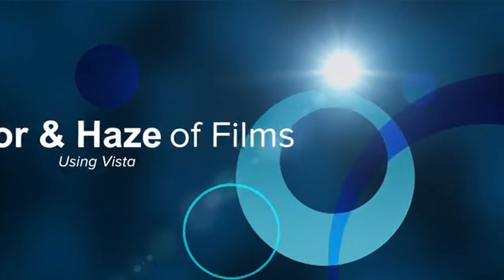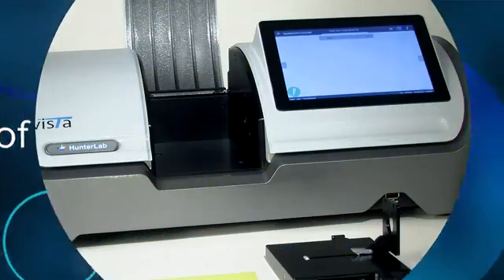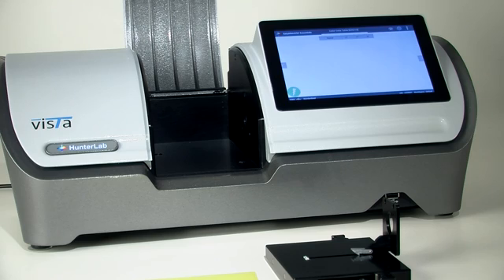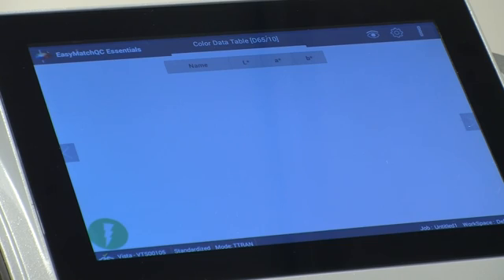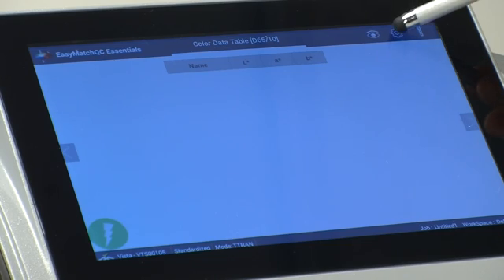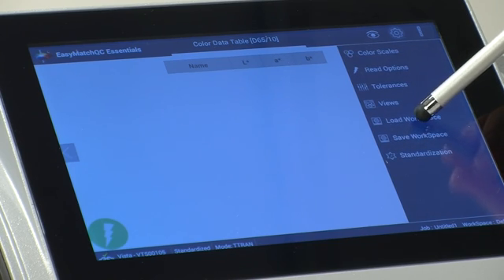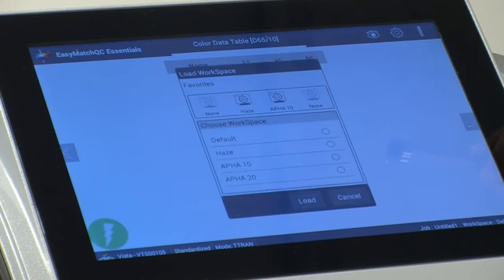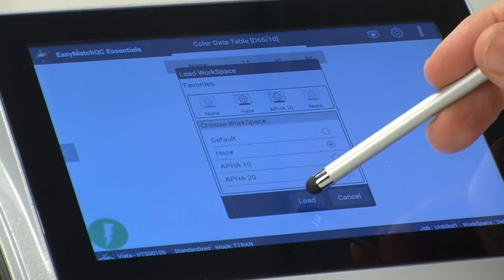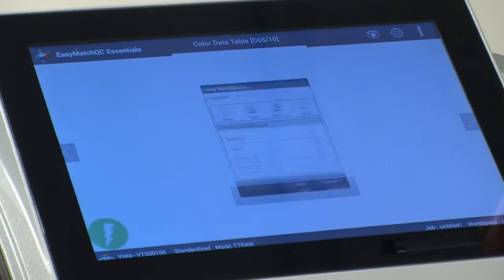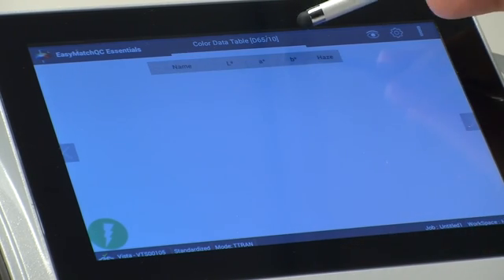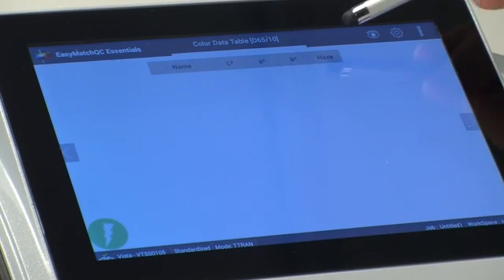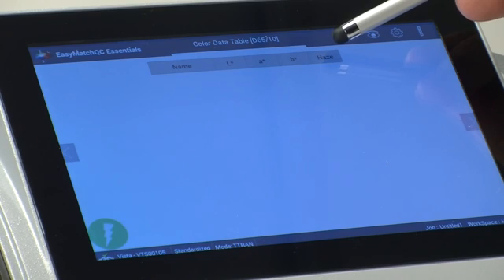This video demonstrates how to measure both the color and haze of films. Using the workspace settings icon, select Load Workspace. Select Haze as your workspace and then select Load. The color space and haze labels will now be displayed on the screen.